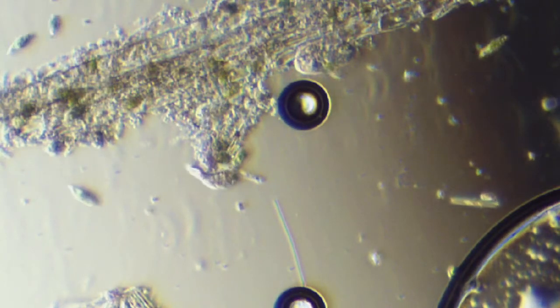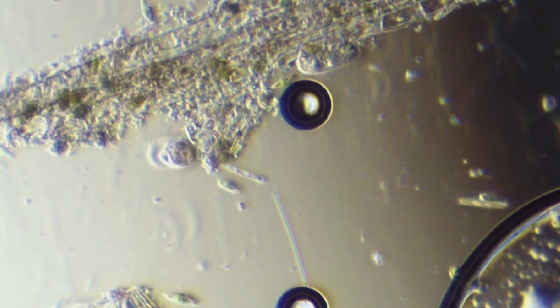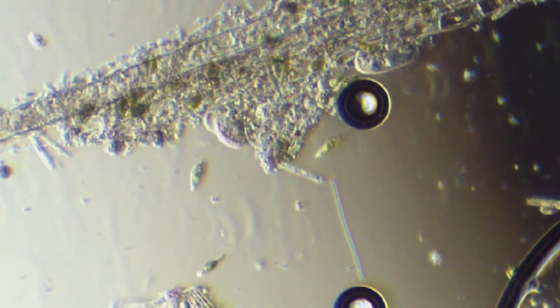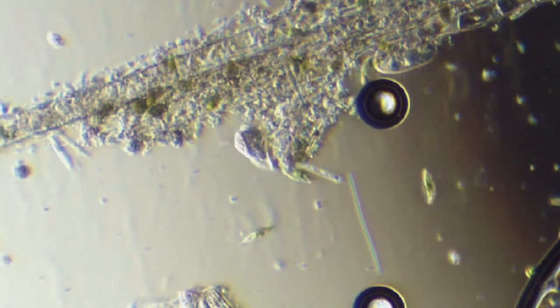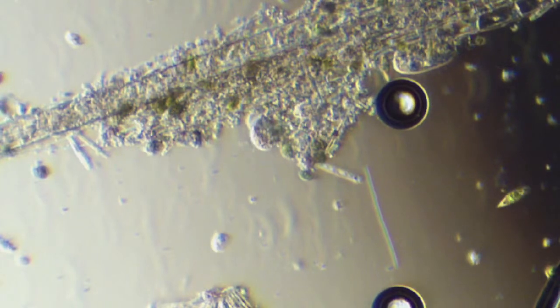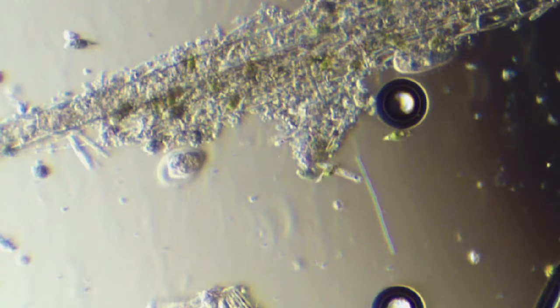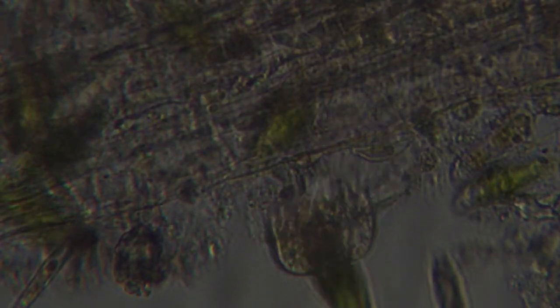Look at this guy, it's really cool. See it flipping over? I've seen this one before where it does this behavior. The lip of the cell is very flexible and it's flipping up as it's trying to climb over bits of debris. I think this deserves a little more magnification. You can really see it. They have a very thick central mass of the cell, and the edges are very tapered and thin. So it's able to flip up the outer lip.